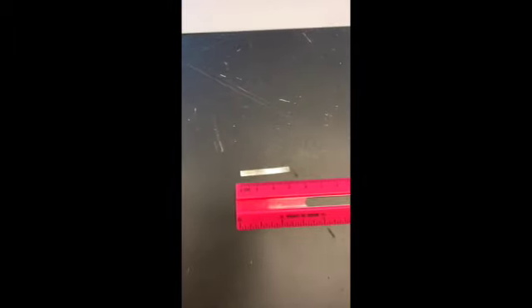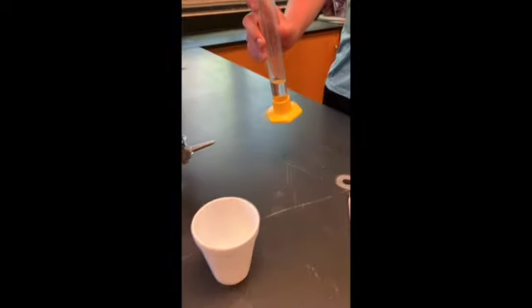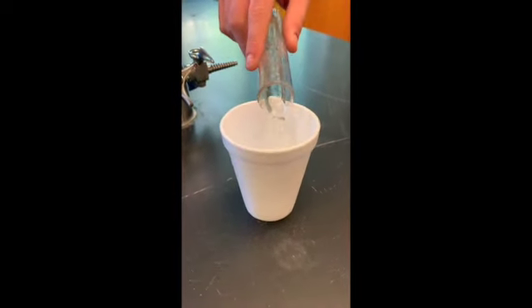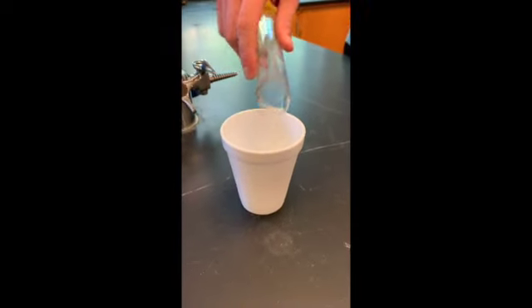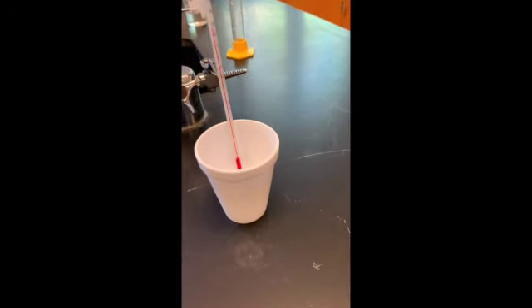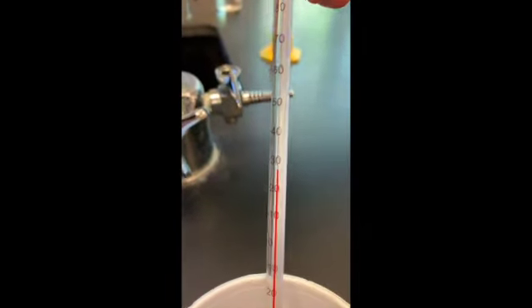All right, we are then going to react that magnesium metal with hydrochloric acid. Maurice has 30 milliliters of hydrochloric acid, and he's going to put that into our calorimeter, which is a styrofoam cup, and he's going to take the temperature of that 30 milliliters of hydrochloric acid, and we're going to have to record that. So we're going to take a look.